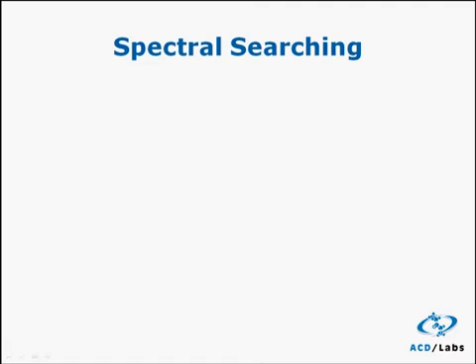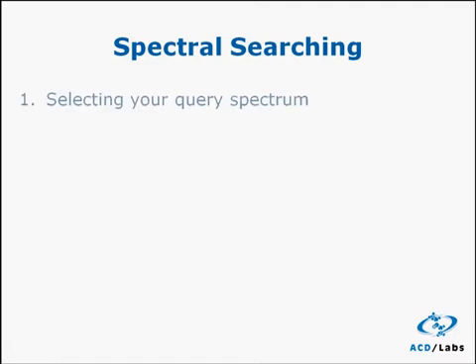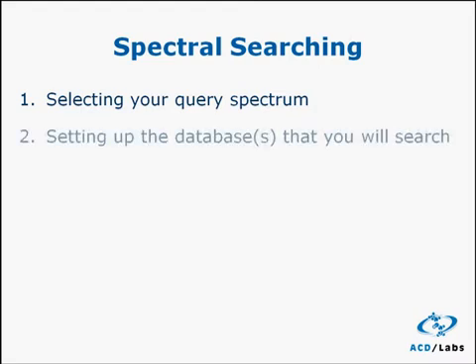We'll now look at spectral searching. There are four steps to any spectral search. First, you'll select your query spectrum, or the unknown. Second, you'll set up the database or databases that you'll be searching.